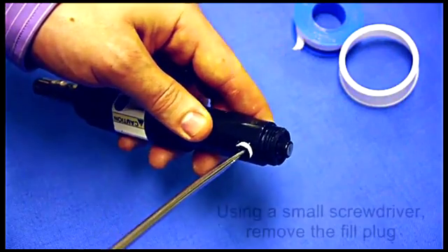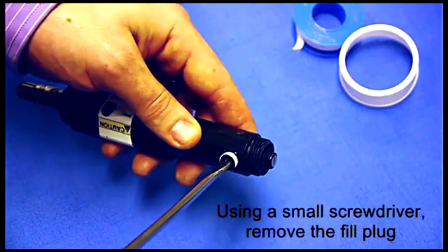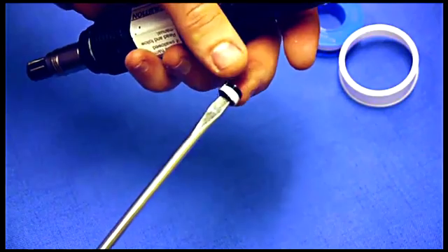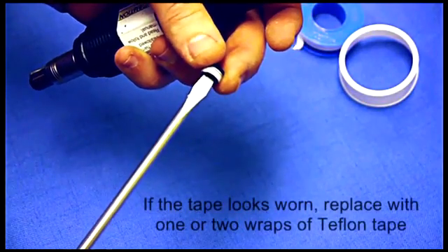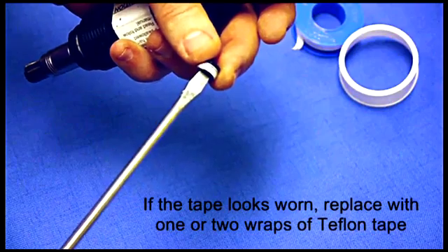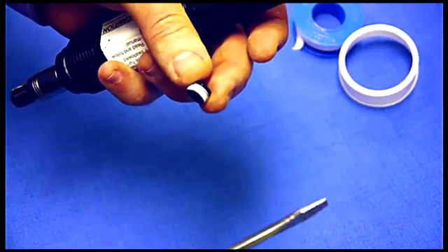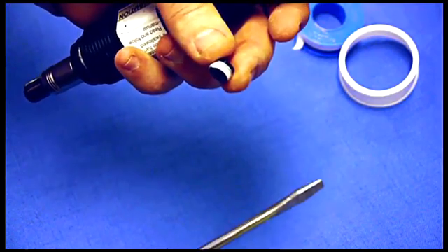Next you want to remove the fill plug and check to make sure there's an adequate amount of pipe tape still remaining on the fill plug. Here I see there's still a good amount so I don't need to replace it. If there's not enough, you want to first remove the excess pipe tape and then place about one to two wraps of pipe tape around the fill plug, no more than two.